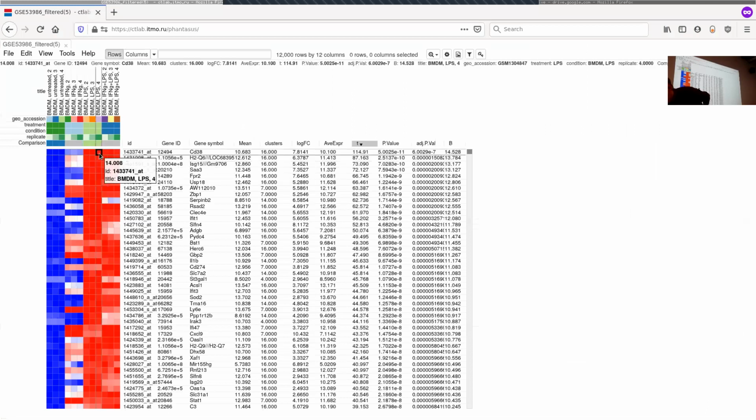So like in LPS condition, we see that there... Excuse me, can I ask, what is a T? Well, it's almost, it will be on our list next.